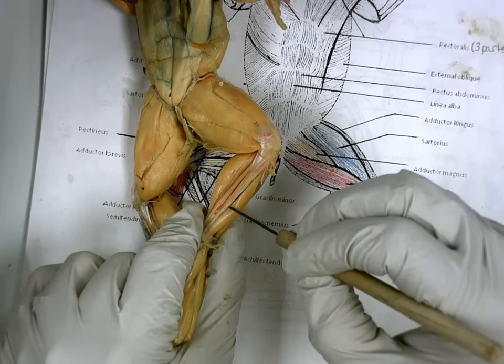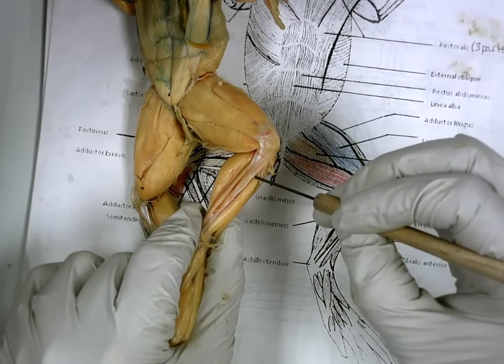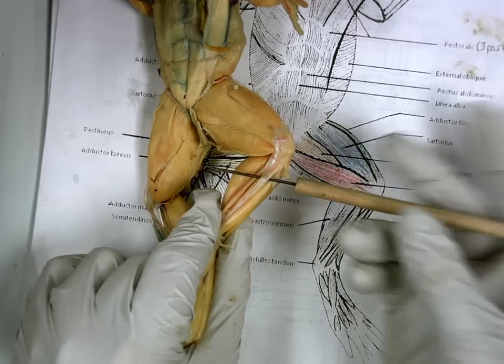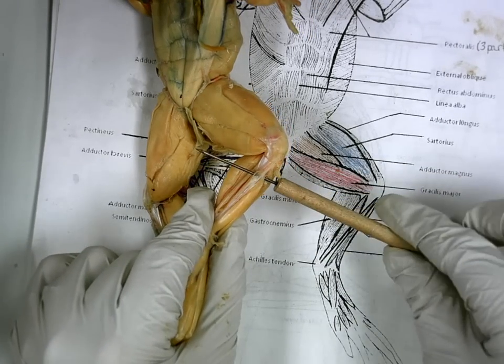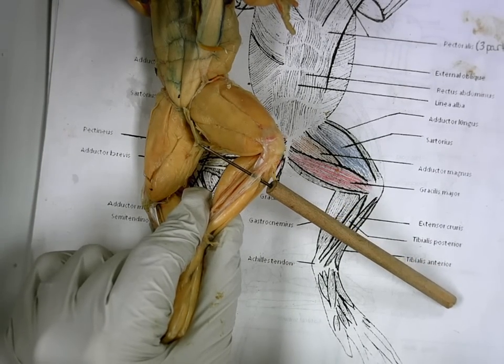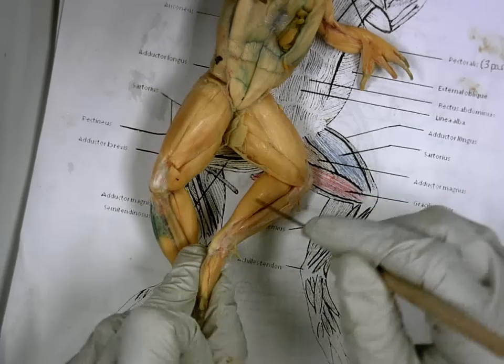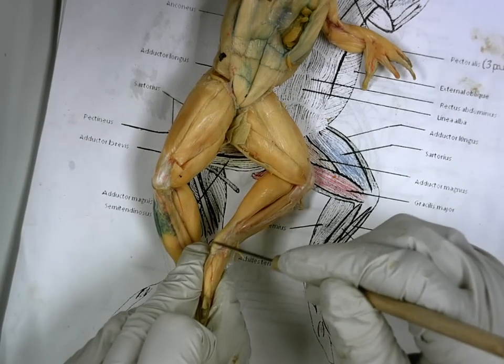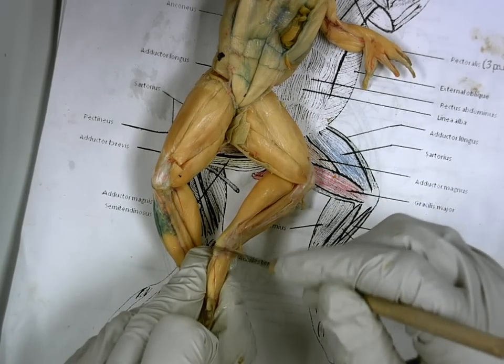If I follow my probe all the way up at tibialis anterior to the top of the A, and I stab in towards the bone, I have a tiny knee muscle. Extensor digitorum longus. Gastrocnemius is held by what thick tendon? Achilles tendon. Excellent.